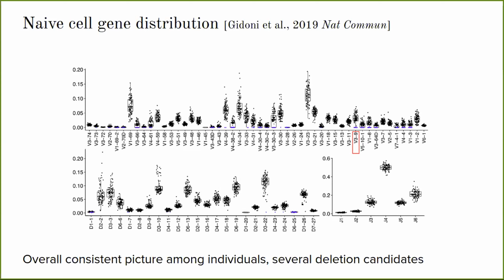So what we did is use a binomial test to ask how far the lower population that we see here is from the upper one. If it was far enough, then we said that probably this group of individuals don't show this gene, or there is a problem with transcribing this gene.